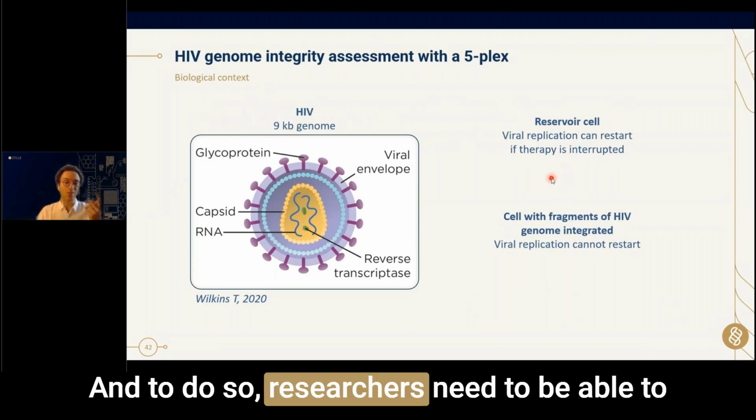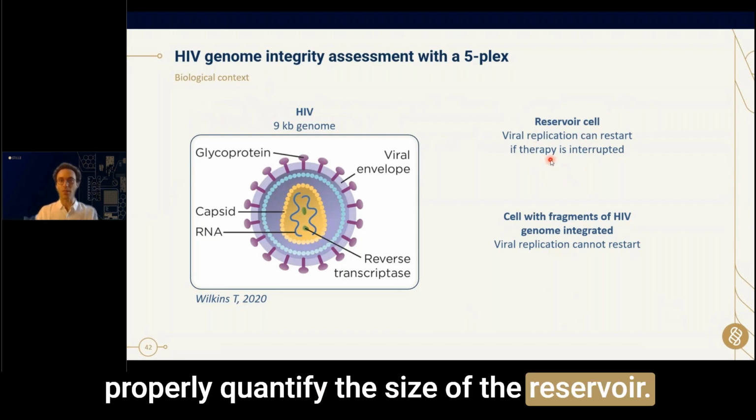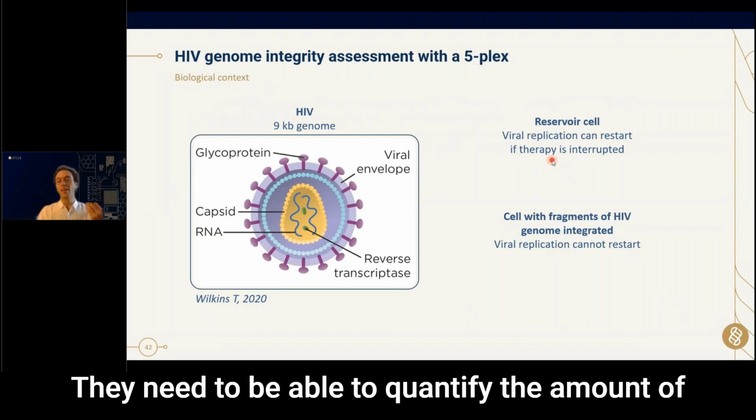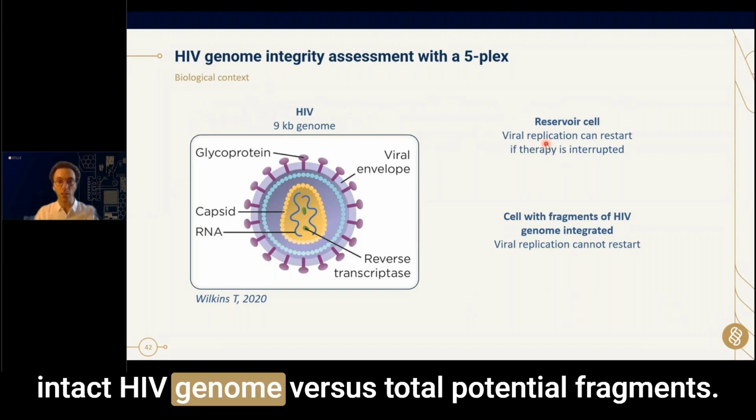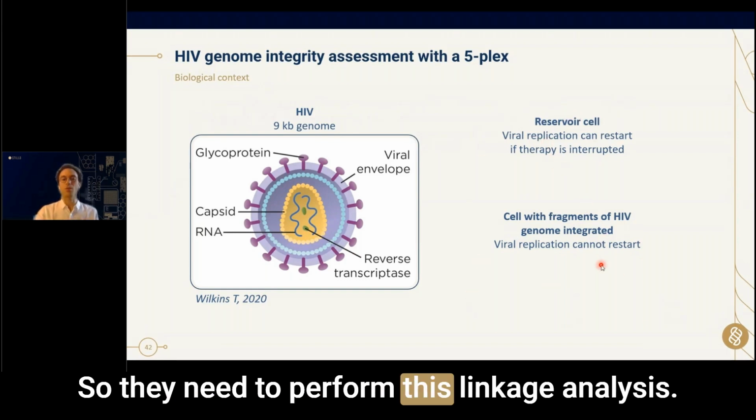And to do so, researchers need to be able to properly quantify the size of the reservoir. They need to be able to quantify the amount of intact HIV genome versus total potential fragments. So they need to perform this linkage analysis.